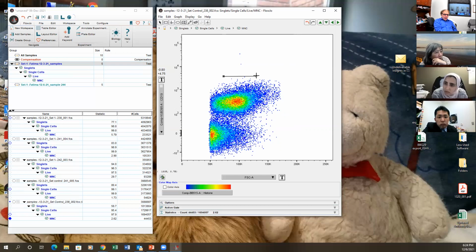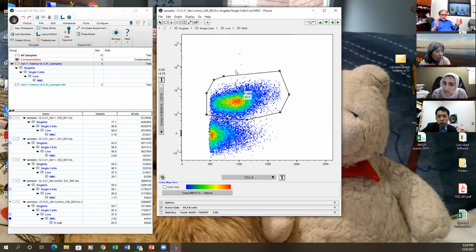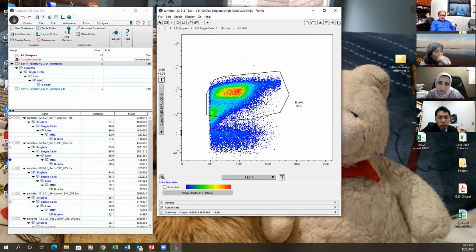And I took a video of the tube. It was really good because I saw the magnet, and just against the wall, you can't imagine how any beads could resist plastering. The tube was plastered on the wall with the non-bead cells, but any bead should be out there too. I don't know how I could avoid it. It was a very good magnet separation. Yeah, I'm going to move this gating.